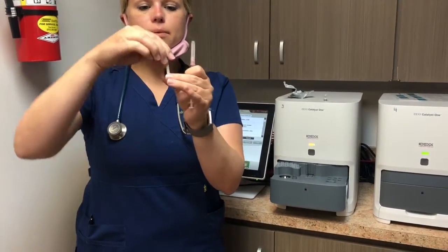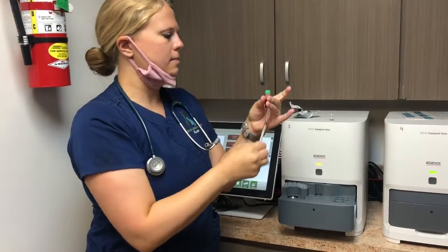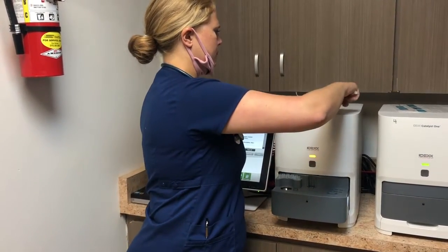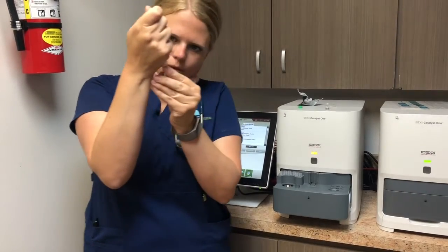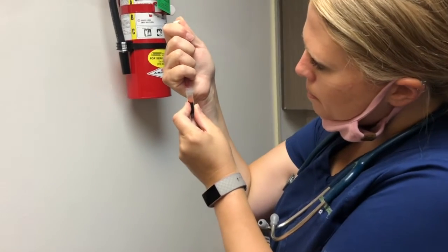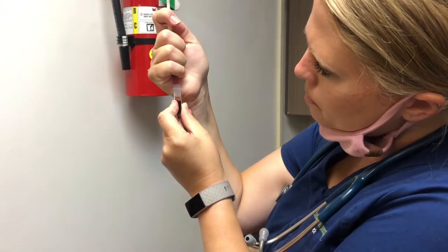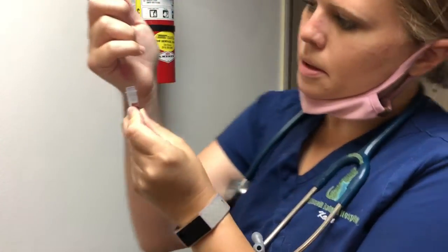Now that I've got our sample spun down, you can see where we've got the serum as well as the red blood cells at the bottom. I'm going to use my syringe and draw up just the serum for our sample. Careful not to get any of the red blood cells from the bottom. Just a little bit more. Perfect.